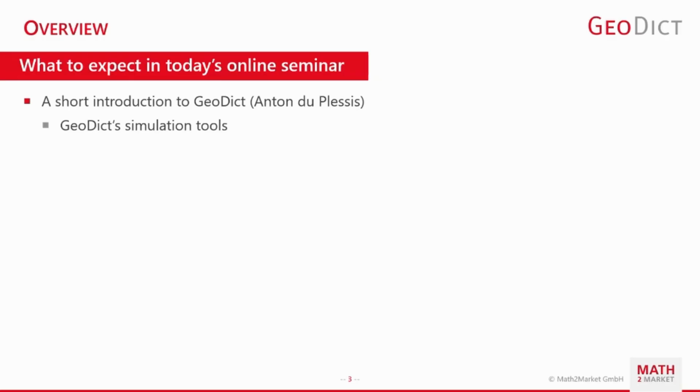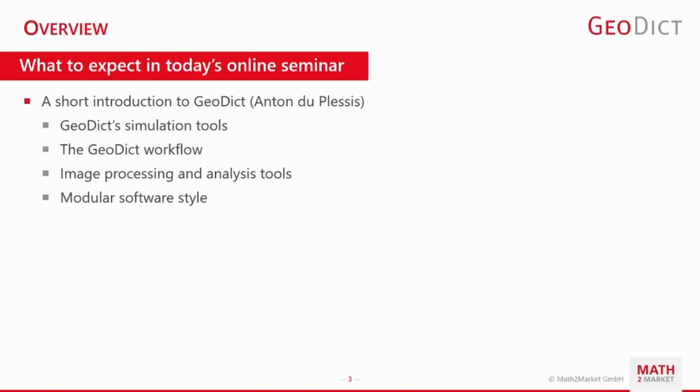So I will present the simulation tools that GeoDict is well known for very briefly, and the typical GeoDict workflow, which then explains the context of where image processing and image analysis tools have been used for many years, and where we're now putting the spotlight in this seminar to showcase the strength of this capability in particular. I will also introduce the software generally in terms of its modular style, the different kinds of modules that you can make use of. And this will be followed by the live demonstration by Jonas.